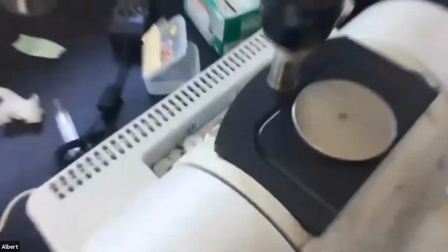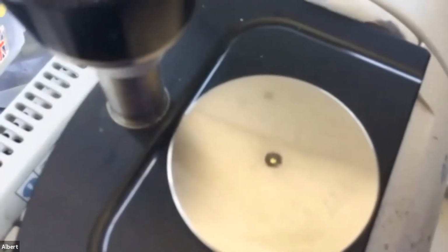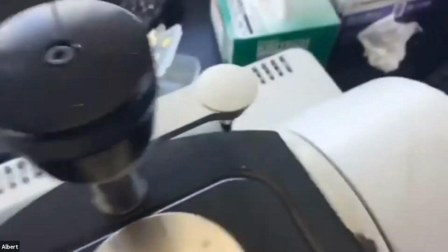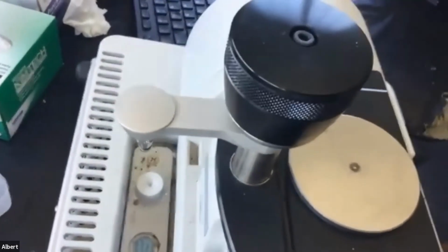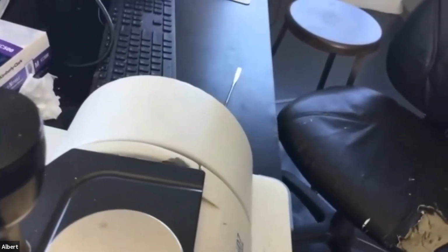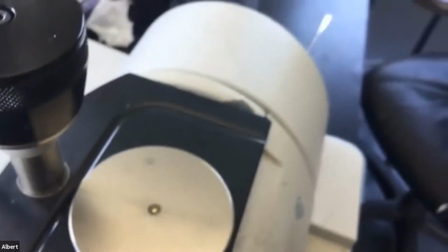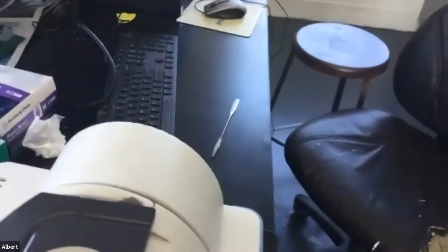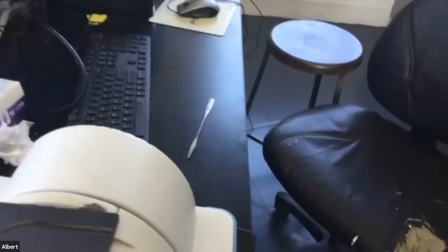All right. So you can see now, you see that little hole in the middle, that's a diamond. That's a diamond on the plate. And then there's another diamond in the arm. Probably see it better from back here. All right. And so when those two touch, the radiation is going to go through the diamond that's on the plate, and it's going to penetrate that, go through your sample, and then what's in the arm is going to be able to detect the sample and also the different functional groups.